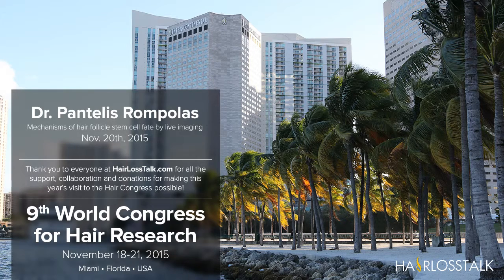The question we wanted to ask now is, looking long-term, what is the fate of the cells during the entire hair regeneration process? Starting from telogen, we essentially have a very small group of multipotent stem cells. All of these now have to somehow make fate decisions as to how to self-renew, how to generate progenitors, and then generate the 7 different lineages of the fully grown hair follicle. So how does this happen? We used the inducible Cre system to label individual stem cells in the telogen follicle and distinguish them among the general population.